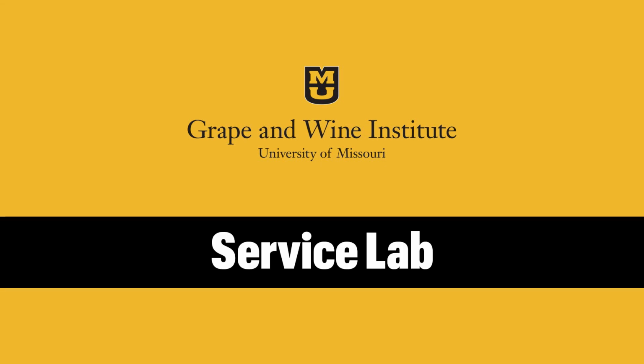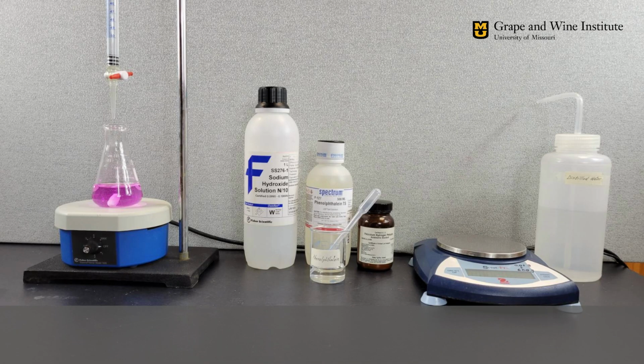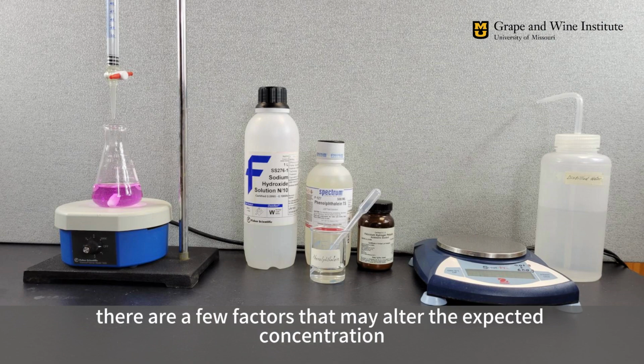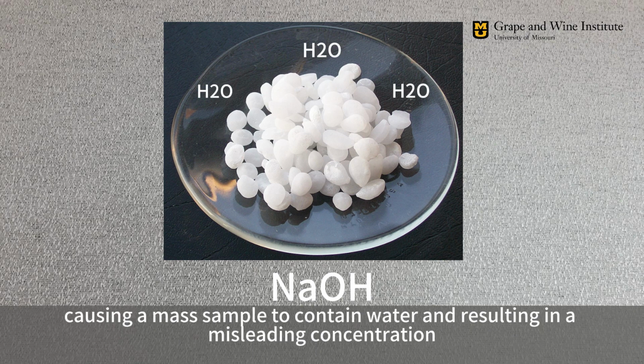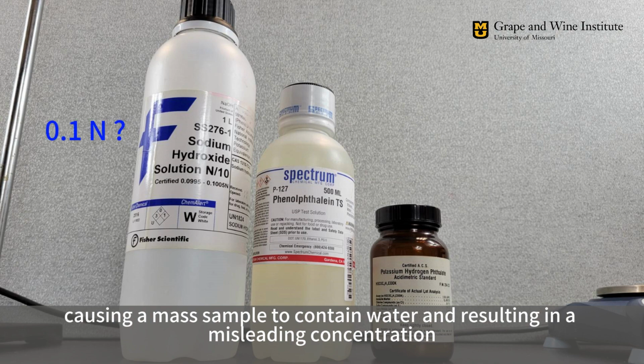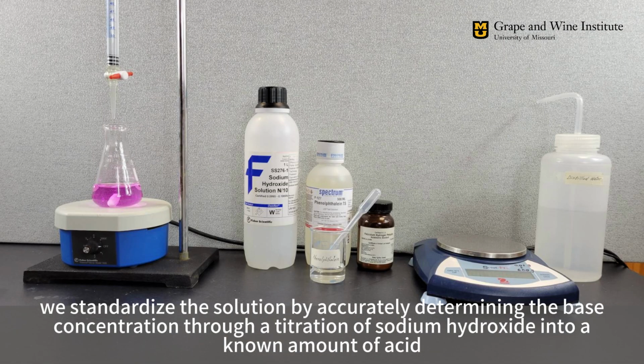In this tutorial, we will go over the process of standardizing a sodium hydroxide solution. When a solution is made, there are a few factors that may alter the expected concentration. For instance, sodium hydroxide can absorb moisture from the air, causing a mass sample to contain water and resulting in a misleading concentration. To fix this problem, we standardize the solution by accurately determining the base concentration through a titration of sodium hydroxide into a known amount of acid.